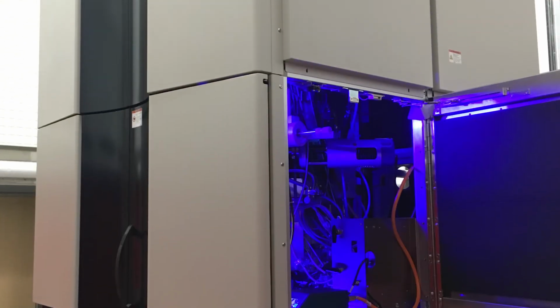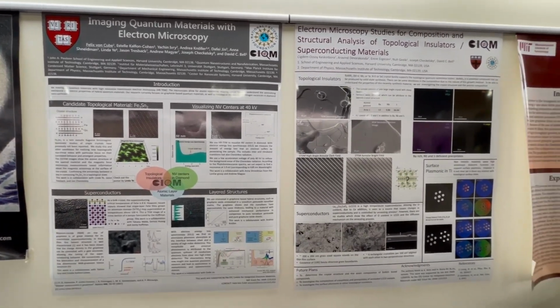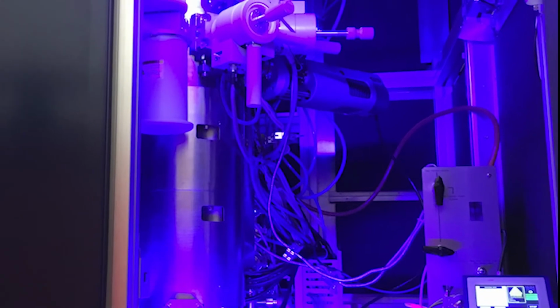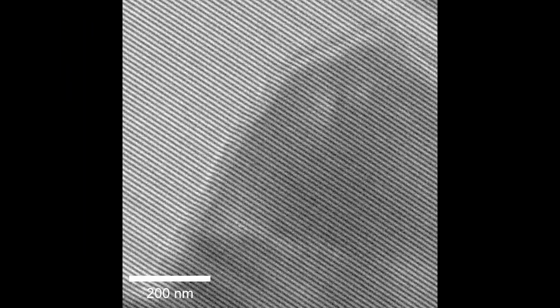Our newest microscope is custom designed for Harvard's quantum engineering research needs. In fact, it's so new, it's still being installed. In addition to the techniques already shown in this video, it can also do holography.